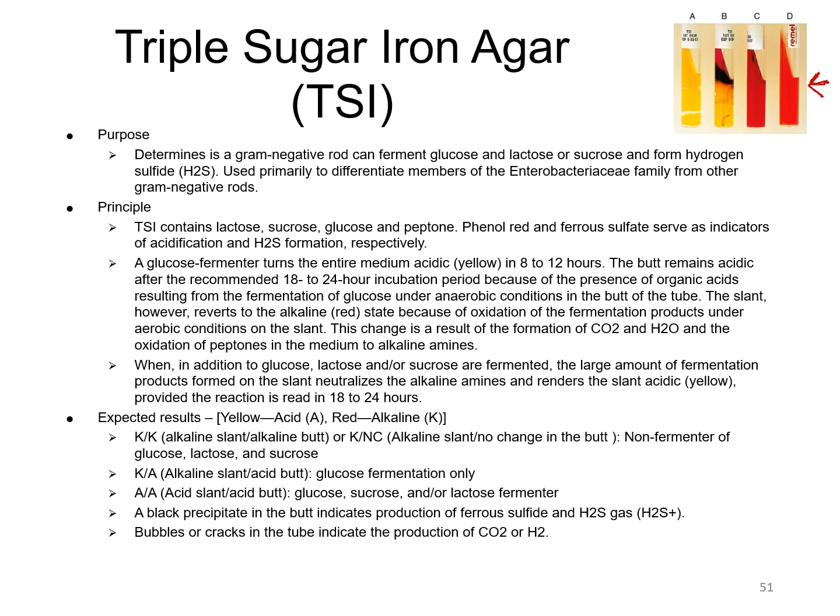That particular presentation would be here in C, where you have an alkaline, so you don't see any sort of color change.